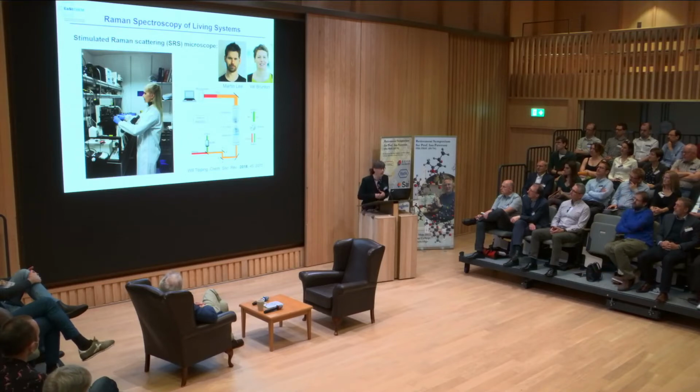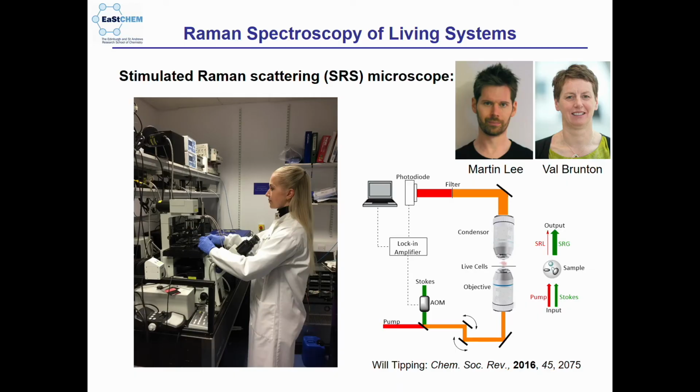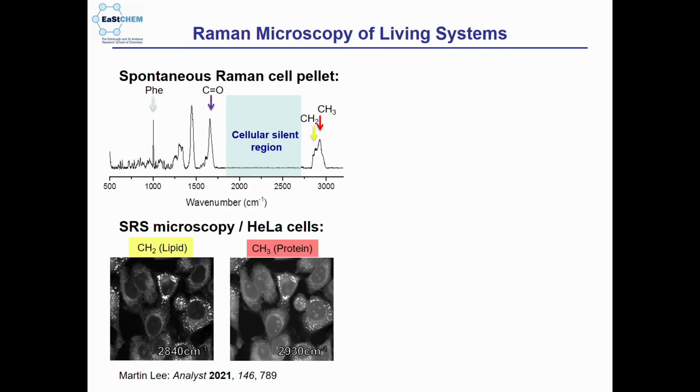This is Crystal. It's not a beautiful microscope like you buy in a box. So this is Crystal at the microscope, which you can see as a series of components, and which we've put together, and then bits break. As soon as you have more than one laser, it's a bit of a problem. Bits break, you have to get it repaired, it goes back to Germany, comes back, whatever. But you have that nice time frame when everything is working and you can take some nice images.